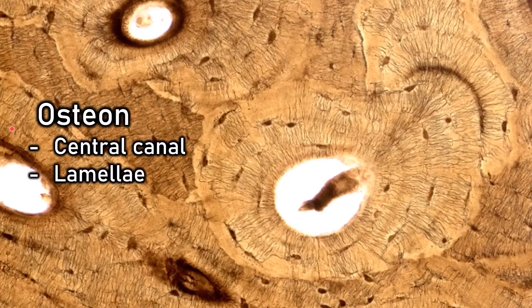If you look at what's separating the lamellae, there are all these dark spots. Those dark spots are actually open spaces — they've just been stained with a dye. Those open spaces are called lacunae, and in the lacunae you would find osteocytes.